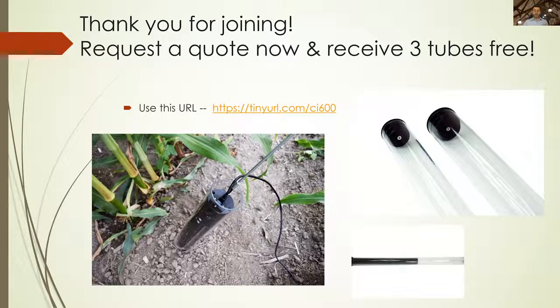Can you see mycorrhizae with the root images? Yes. I believe I had one picture on the slide that was showing some of the mycorrhizae in root hairs, but yes, you can definitely get down to that level. Now, with those higher scans, I do want to say that it is going to take a little bit longer to do a full scan around, but you're able to see it.